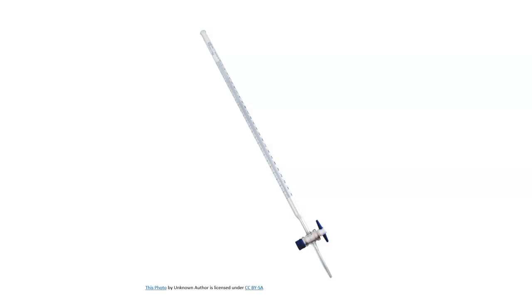You're going to have to wash and rinse your burette. What's going to happen is you're just going to rinse it with water. We're rinsing with DI water. You're going to go over to the sink and open your stopcock, and you're going to let it drain out the tip. You're actually washing the tip at this point. At that point, you're going to close the stopcock, and we're going to condition the burette.